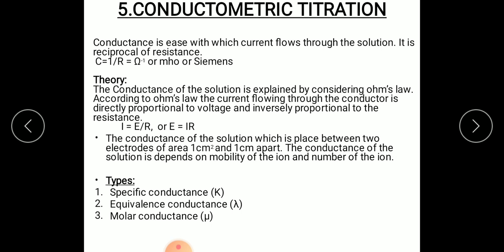The second one is equivalence conductance, that is lambda. This is the conductance of the solution when 1 gram equivalent weight of solute is placed between two electrodes of area 1 cm square and 1 cm apart. The third one is molar conductance, that is mu. It is the conductance of the solution when 1 gram molecular weight of solute is placed between two electrodes of area 1 cm square and 1 cm apart.